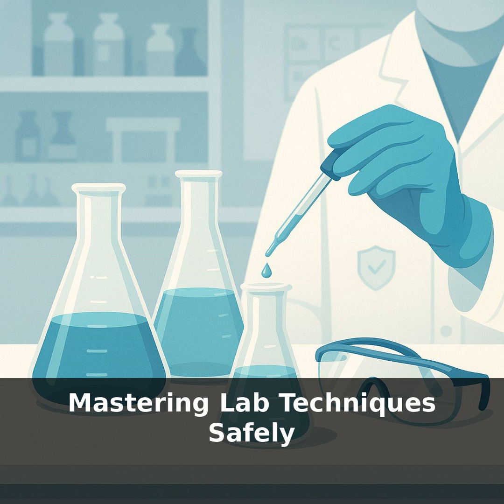A safe lab day really hinges on 3 questions you ask before you touch anything. 1. What can hurt me here? 2. How will it try to hurt me? 3. What stands between me and that hazard? Those answers change with the task.